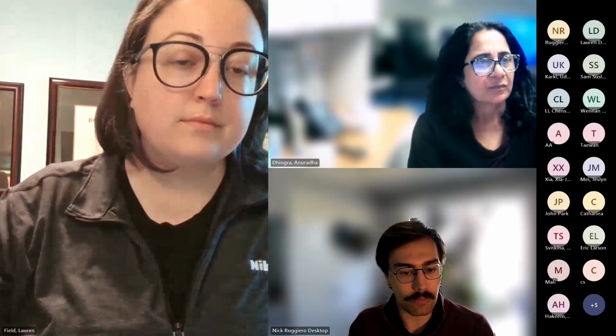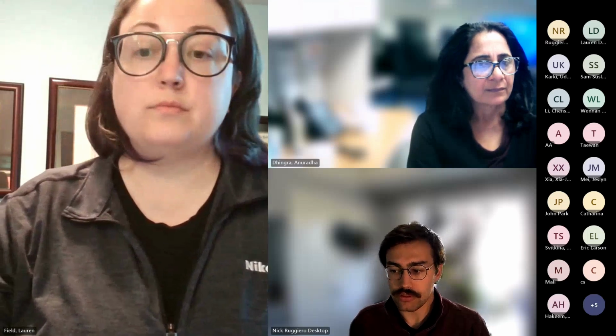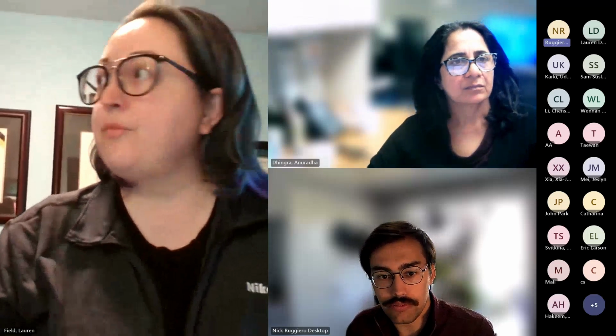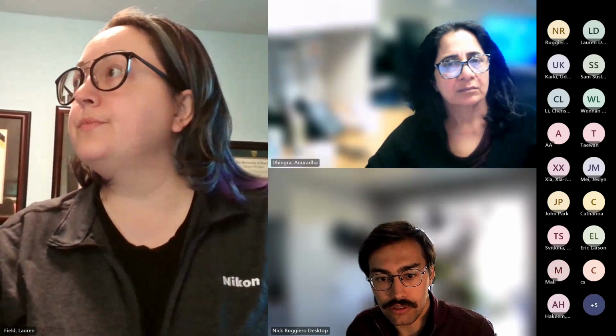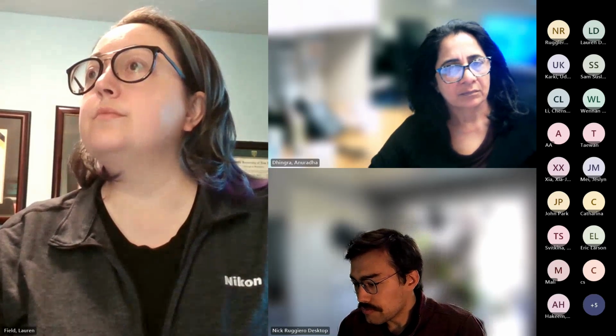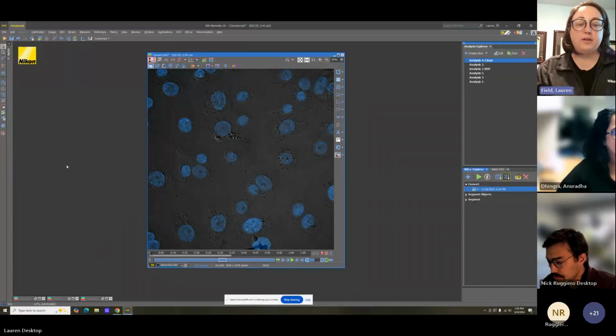Great. Thanks very much. Sure. Okay, any questions on that analysis specifically before I hand it over to Lauren and she talks about some of those other ones? Excellent. All right, I will hand it over to Lauren. I will close out of this. All right. I'm going to take over.